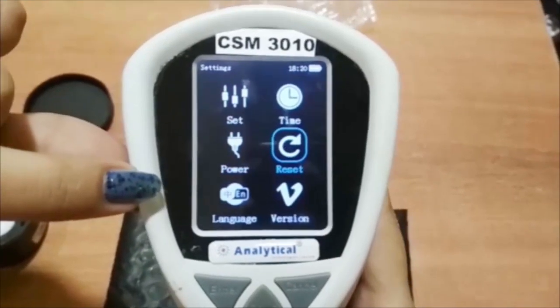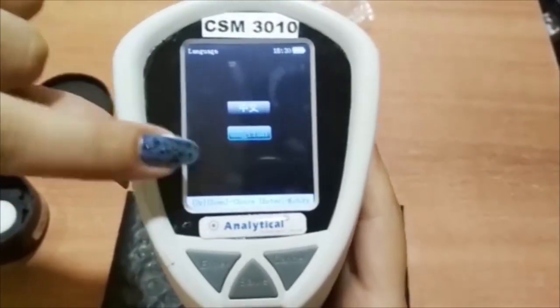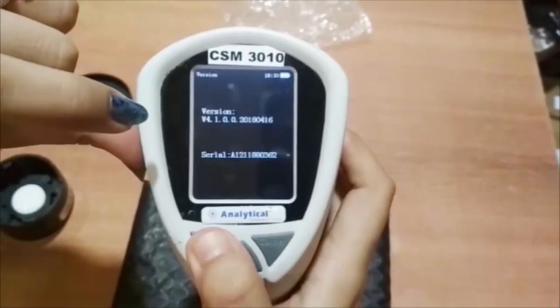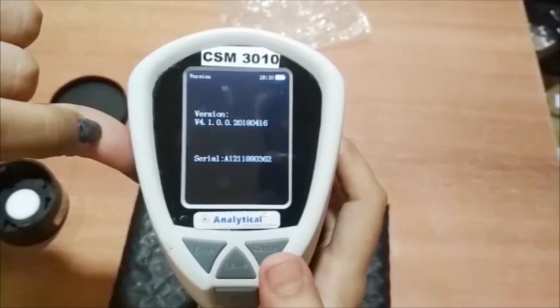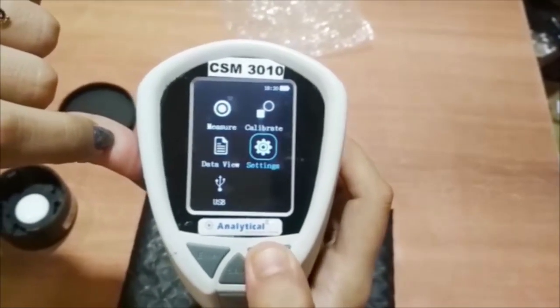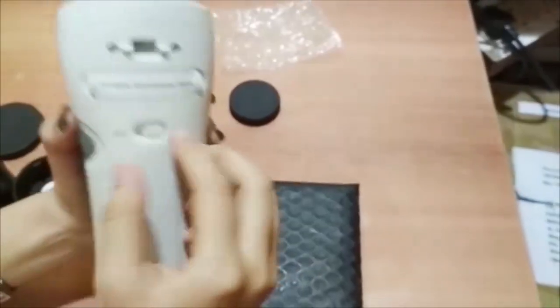In settings, we can select the language and version of this model. In data view, you can get previous data. This is how the colorimeter works. Thank you.